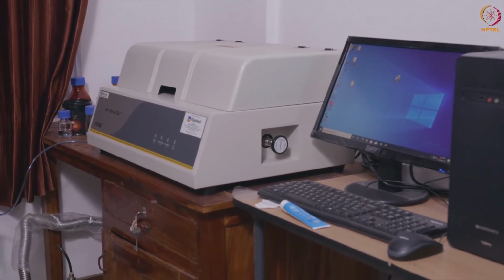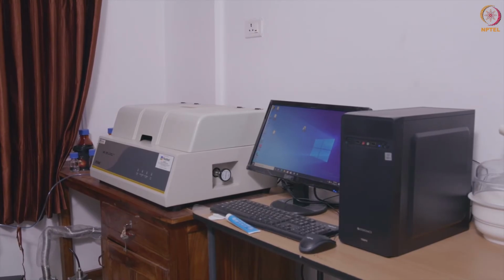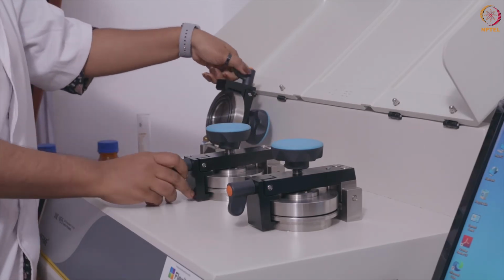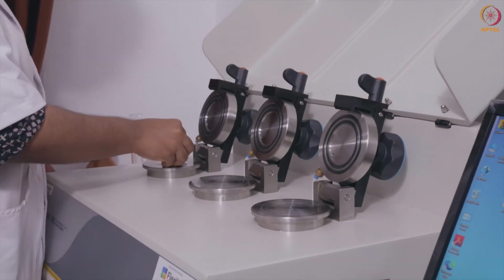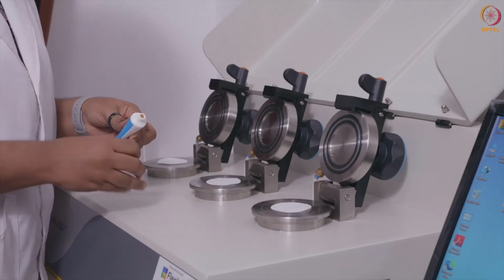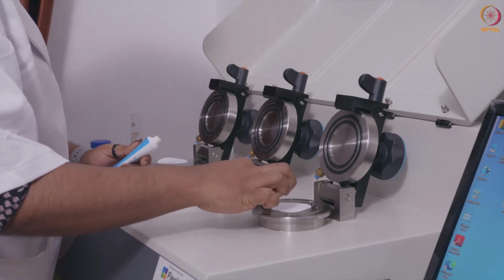This is the OTR tester attached to the oxygen cylinder. Grease is applied along the sides to make it airtight.